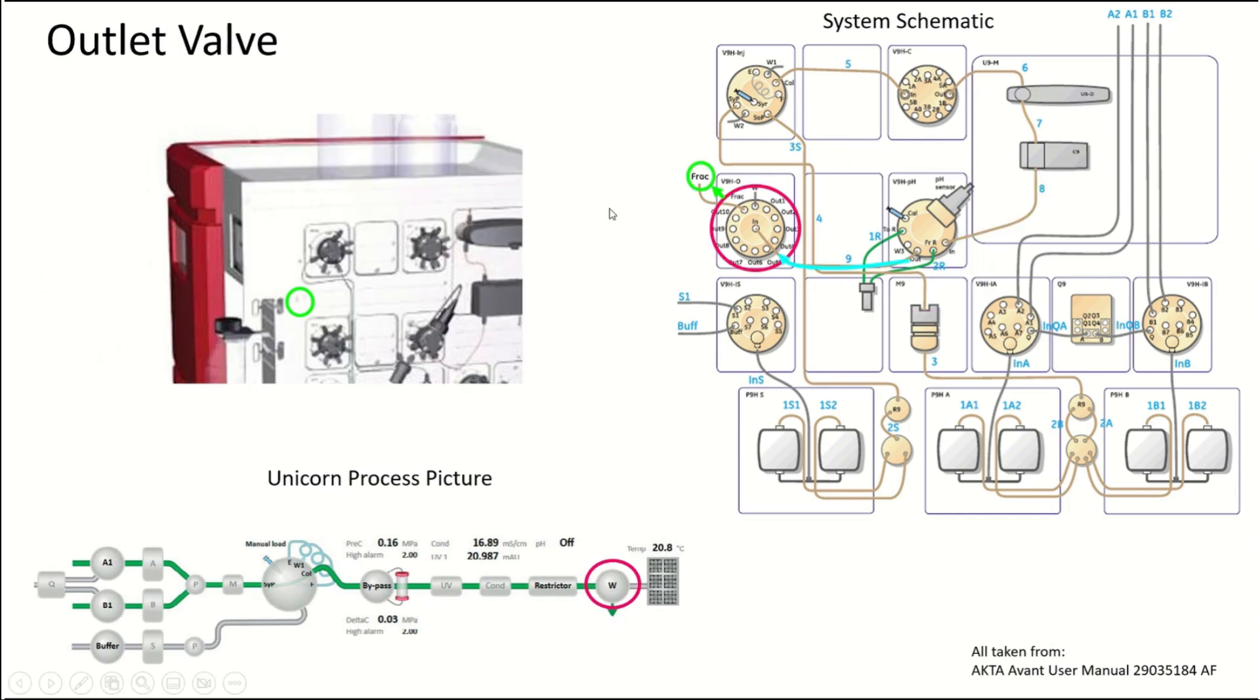After the flow restrictor, we have the outlet valve. The outlet valve has 12 different ports on it. Ten of those ports are just regular outlet valves that you can direct something towards, like a large reservoir. The other two—one of them leads to the fraction collector, and the last one goes to waste.